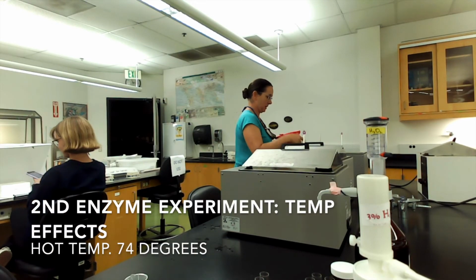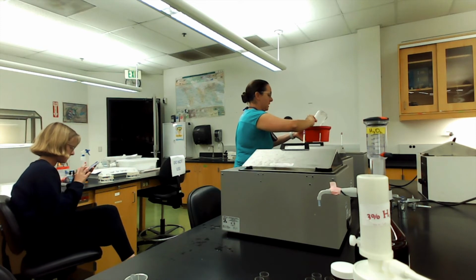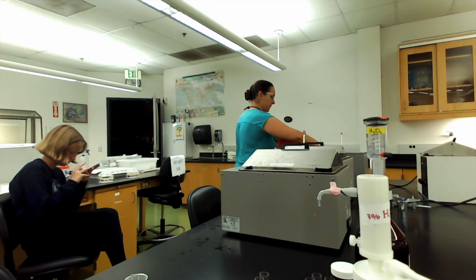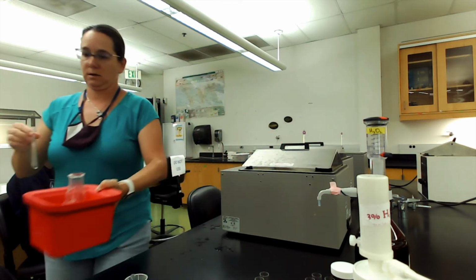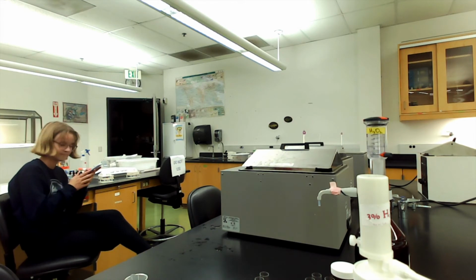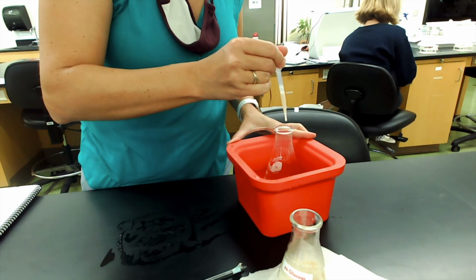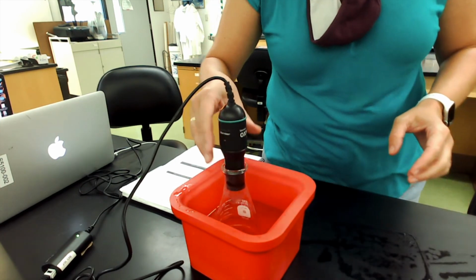Now I'm at the hot water bath, which is about 73, 74 degrees, pretty hot. Get my flask in there. Fill up my little boat with hot water too. Pour the hot substrate in. Come back over here. Add my 10 drops of enzyme and put in my magic wand. Ready, set, go.